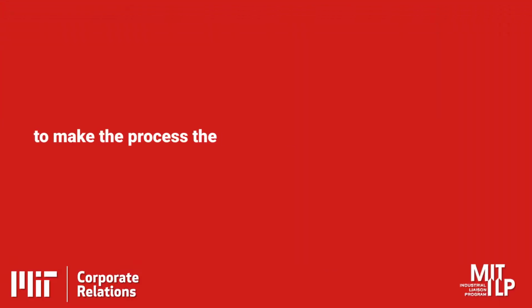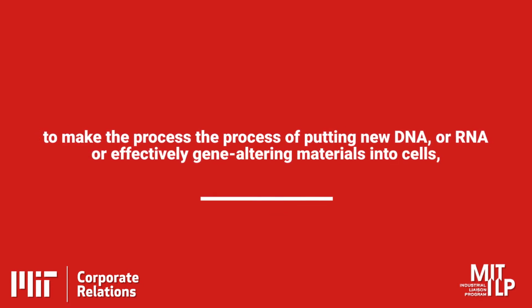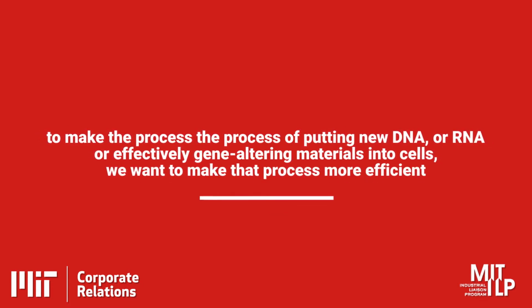And so my group set about trying to come up with new ways of putting genetic material into cells to give cells a broader range of functionality. So there are a lot of challenges in this area. Broadly, what my group is trying to do is make the process of putting new DNA or RNA or effectively gene altering material into cells more efficient. And we want to do it for a wider array of cells.